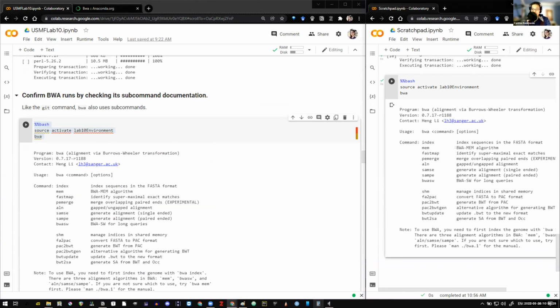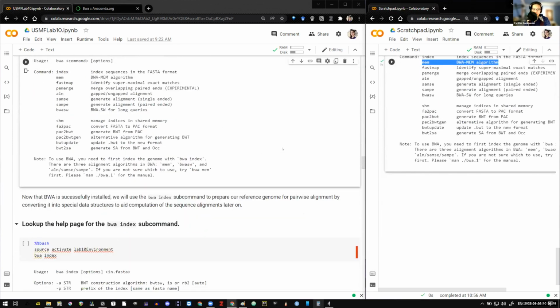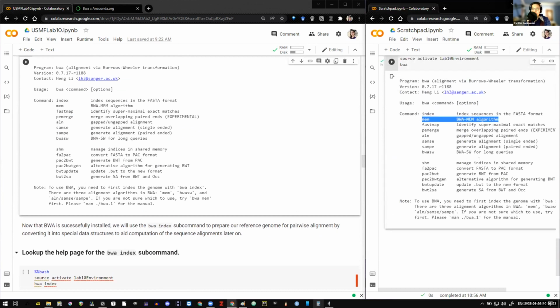You'll see that there are actually multiple alignment algorithms within BWA. For example, there's bwa aln. However, we won't use that, because bwa mem, according to the developers, is the latest and best alignment algorithm within BWA. And by best, that means that out of the reads that you give it, it will have the most success mapping reads to the reference.